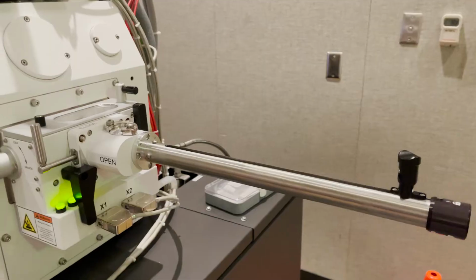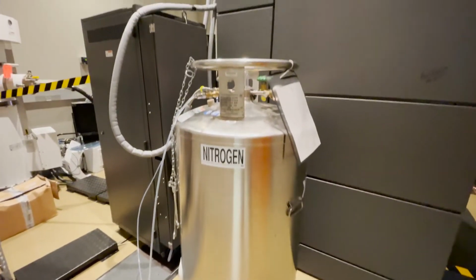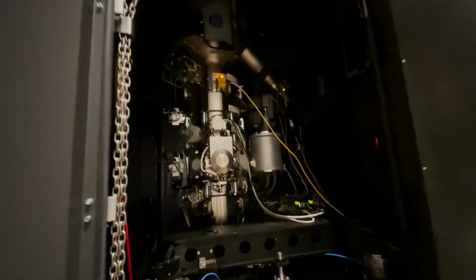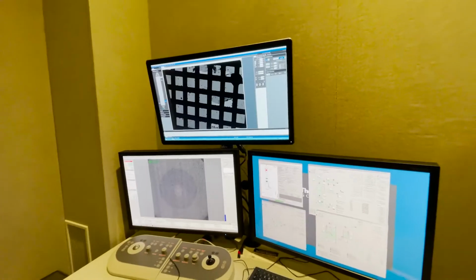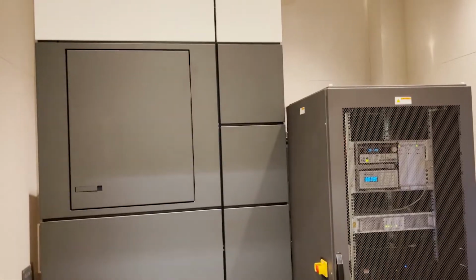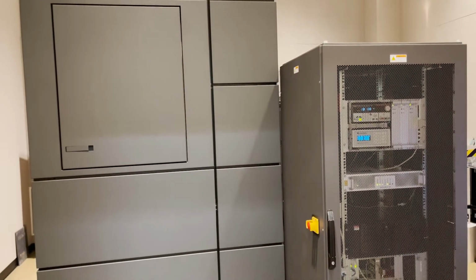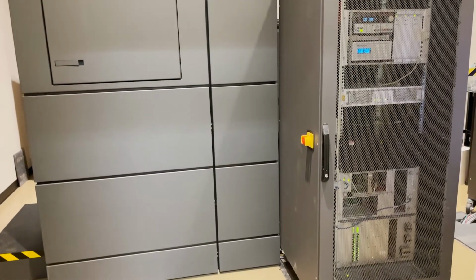prep for cryo-TEM. This lab houses our Krios cryo-TEM, which we can use to obtain atomic scale structure of proteins and protein complexes. Along with our NMR, mass spectrometry, and atom probe tomography capabilities, these instruments provide a holistic understanding on the structure and dynamics of biomolecules and yield insights into their function.